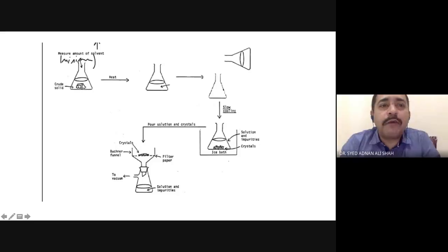So first I have explained to you how aspirin is synthesized. The second step is that the aspirin is crystallized out once you put the reaction solution into cold water. After the crystallization, you have to separate the crystals of aspirin by filtration using the Buchner funnel. First you put the filter paper on it and then filter it, and then pass the excess water through it. That is the reaction workup.